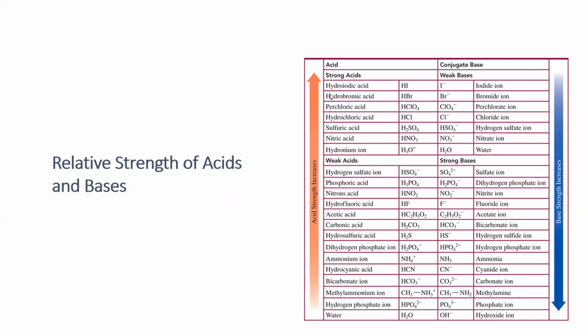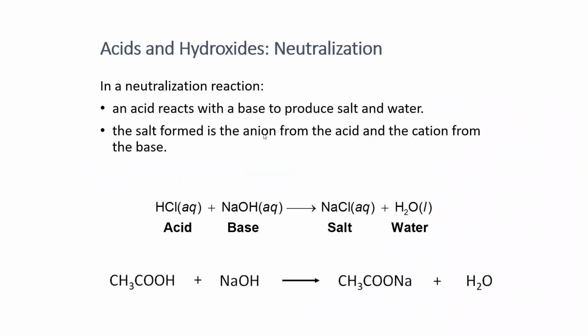And so that's just something to note, because a lot of times when you look at or are talking about a titration, they're talking about a strong acid, but we're going to be using a weak acid. But in our case, it's not really going to make a significant difference. Let's talk about the reaction, because a titration is essentially a neutralization reaction. We're going to be treating an acidic solution with a basic solution, and the acid is going to be reacting with the base. And we call this a neutralization reaction because the acid and base react together to form water and an ionic salt.